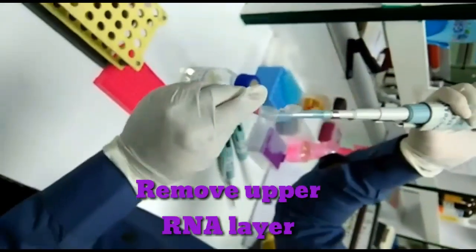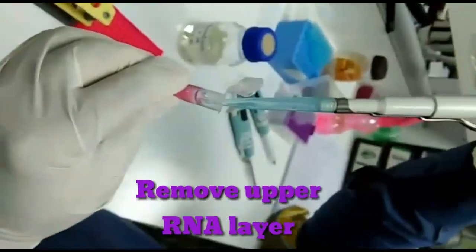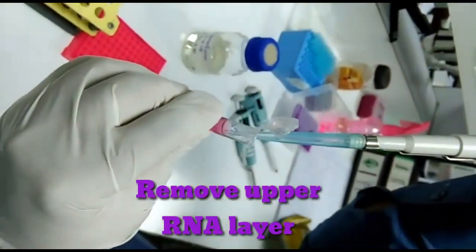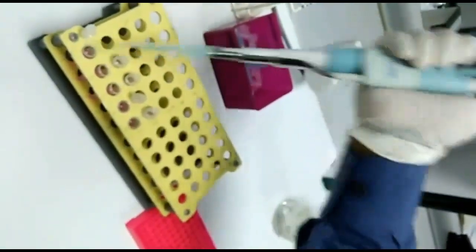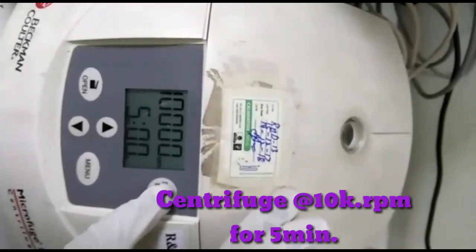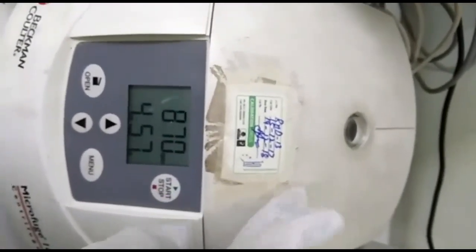After removing the RNA, add 0.3 ml of ethanol 100% and incubate the sample for two to three minutes. Then centrifuge the sample for five minutes at 10,000 rpm.